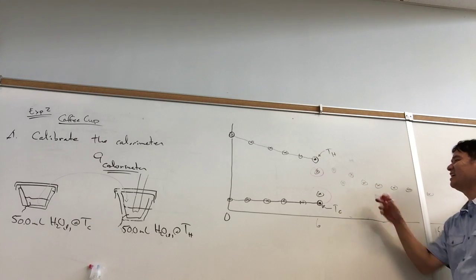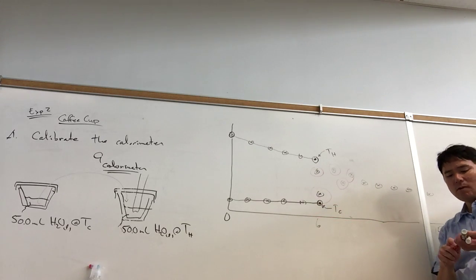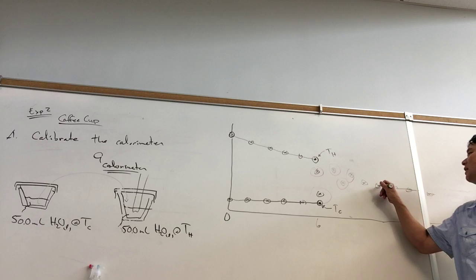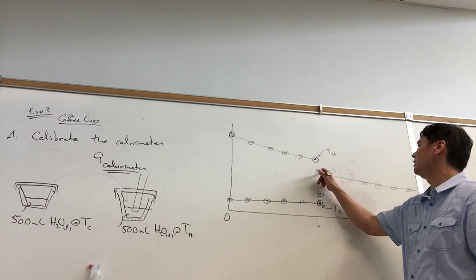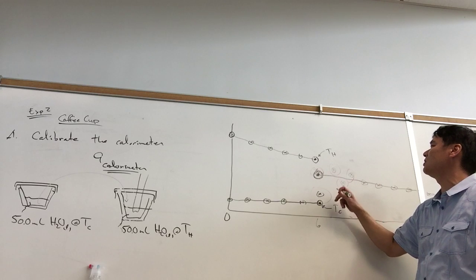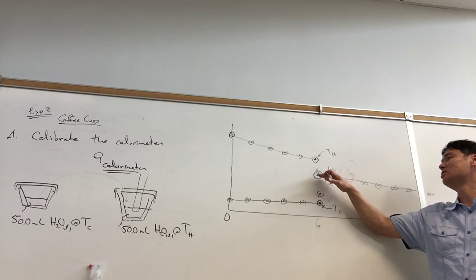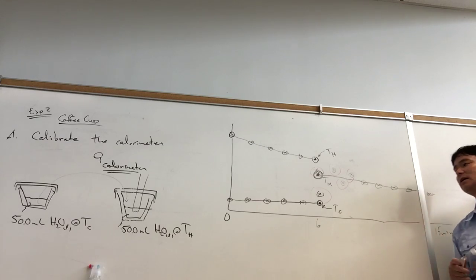And so if you see points like this, this, we ignore those. And what we wait for is this nice steady cooling curve, and then we're going to back extrapolate this. Assuming it cooled steady, we're going to back extrapolate this and say if we could have mixed this in one instant of time, this would be the temperature of the mixture. And then it just cooled down normally from there. So we're collecting a lot of data here.